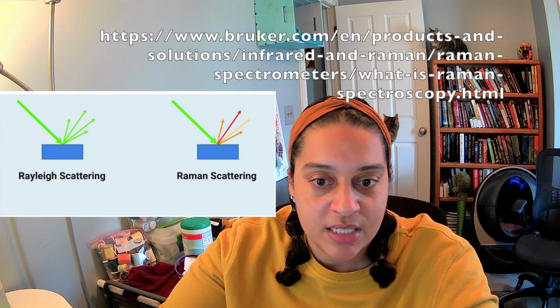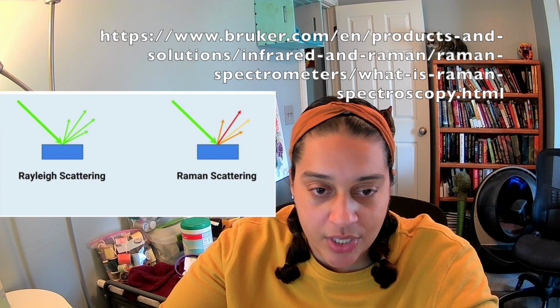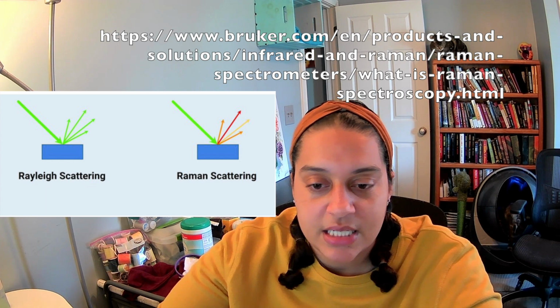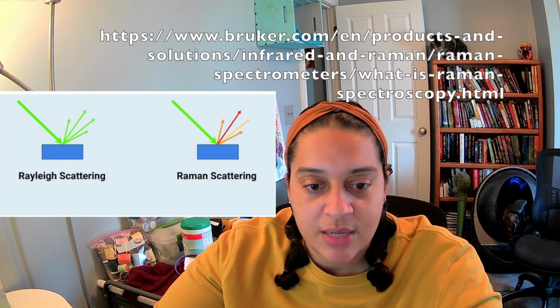Raman Spectroscopy is a technique that involves shining a laser at a substance and analyzing the light scattering off of it. Analysis of the light scattering can provide information about the structure of a compound. Raman is the name of the type of light scattering that is known as inelastic scattering. Inelastic scattering means that the light has a different frequency, wavelength, and color than the original beam of light. Elastic scattering, also known as Rayleigh scattering, means that the light that enters the sample is the same as the light that leaves the sample.